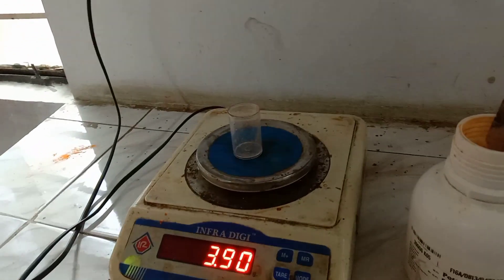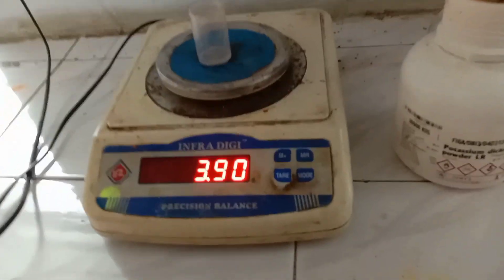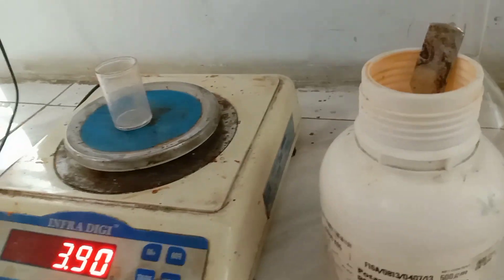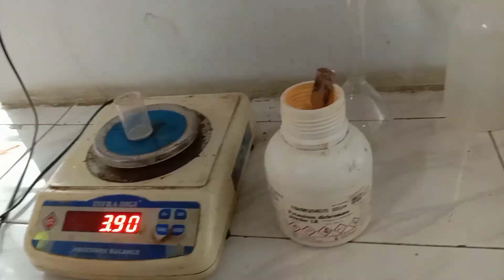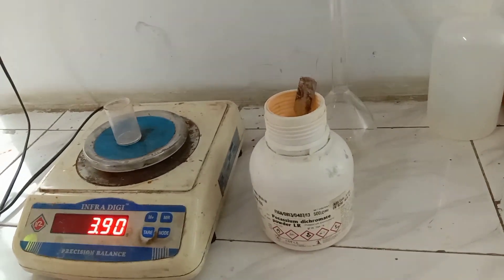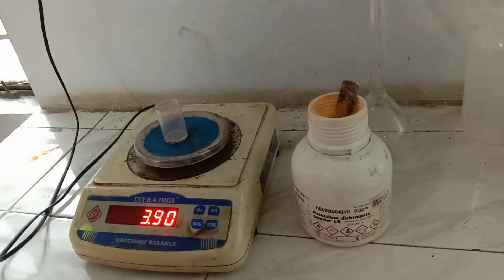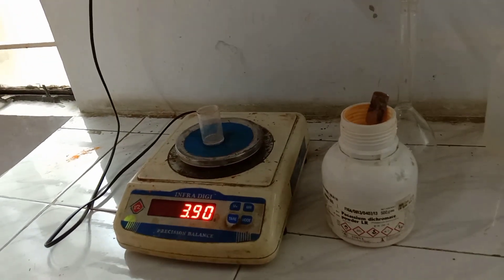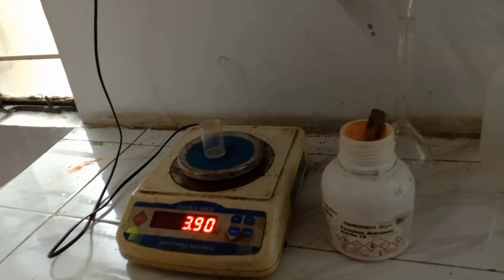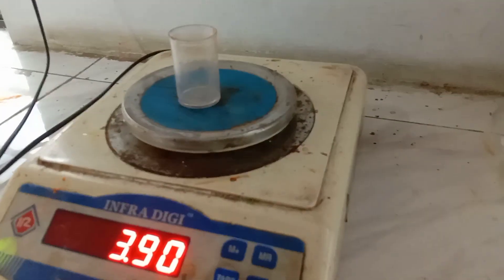To this 3.90, we are supposed to add 1.47 grams of potassium dichromate, which is called the primary standard substance. So, 1.47 plus 3.90 equals 5.37. Now we will add the substance into the weighing bottle until the weight comes up to 5.37.